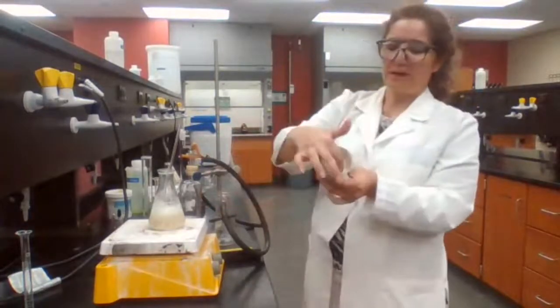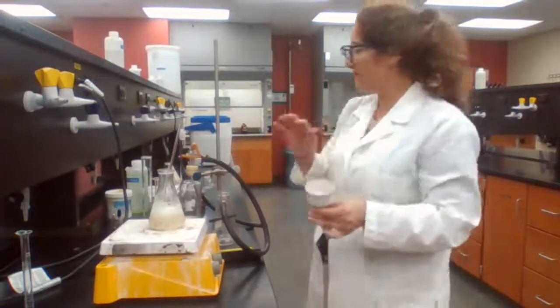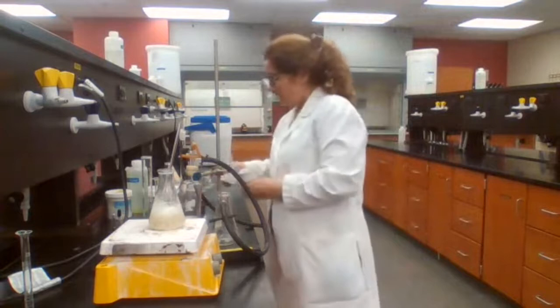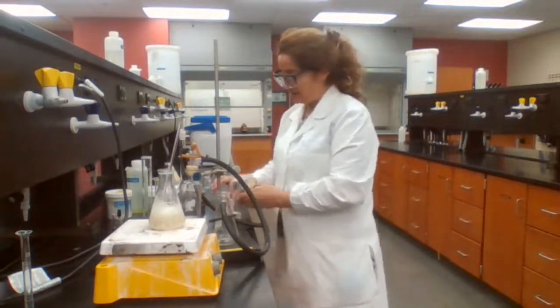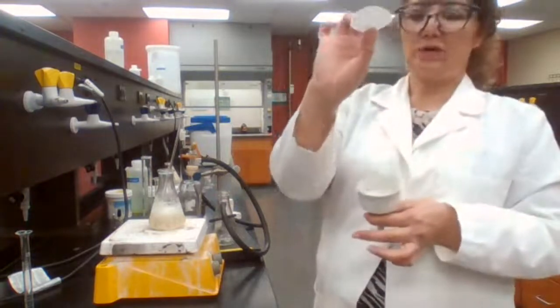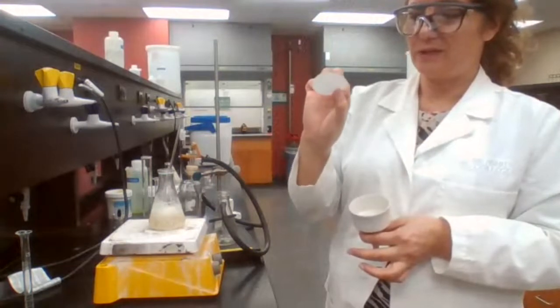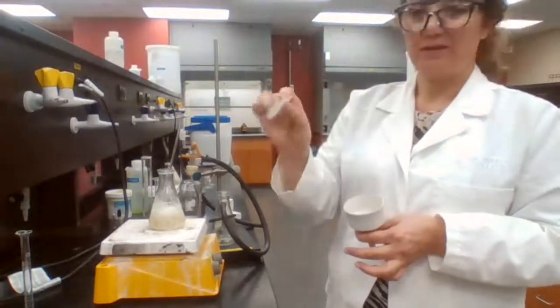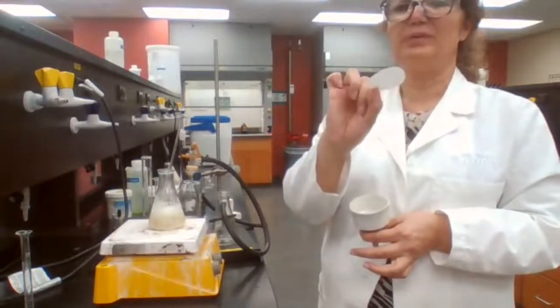Since the opening of the Buchner funnel is large, we must use filter paper. The size of the filter paper depends on the size of the funnel. Since our product is going to stay on this filter paper, it needs to be pre-weighed.